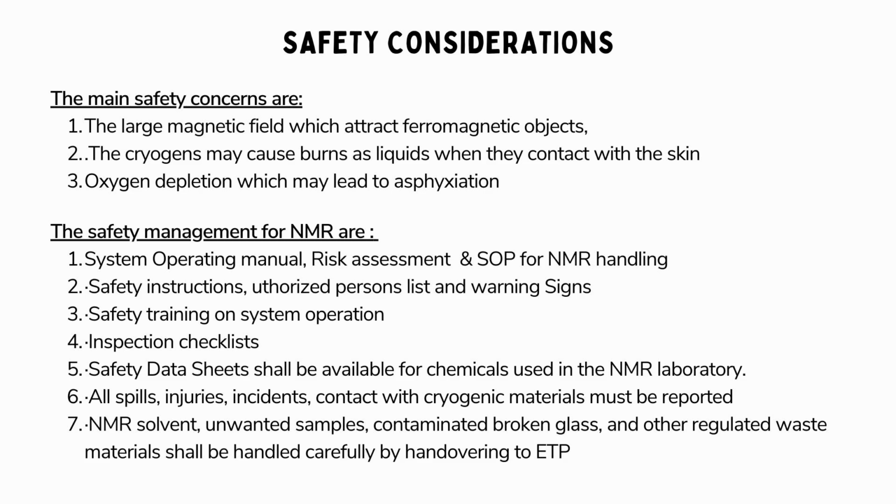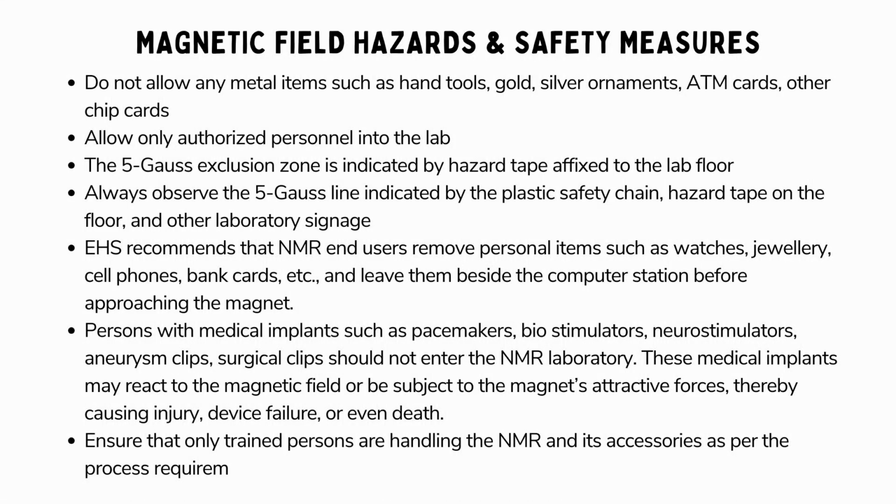Handling NMR solvents, unwanted samples, contaminated broken glass, and other regulated waste materials with care by transferring them to the appropriate waste disposal system. Do not allow any metal items such as hand tools, gold or silver ornaments, ATM cards, or other chip cards in the lab. Only authorized personnel are allowed access.